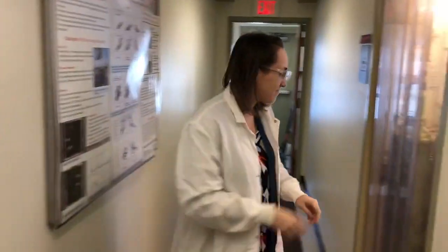I'm here at Michigan Tech at the Carbon, Water, and Soils Laboratory, where we are going to show you around and show you how the graphitization process works and talk about radiocarbon dating. But before we go in, we need our PPE. So come on in and we're going to go meet Kate Heckman.